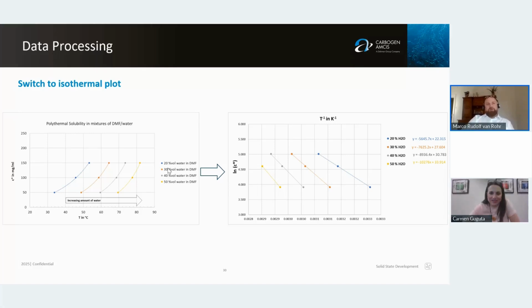the control of the polymorphic form is often only important at the last stage for an API if it is an oral application. So for intermediates, we typically don't control the polymorphic form until it doesn't dissolve again. And in the next step, then sometimes we open this box.